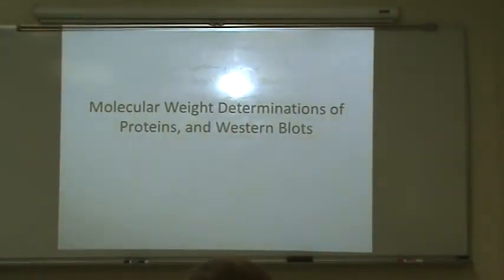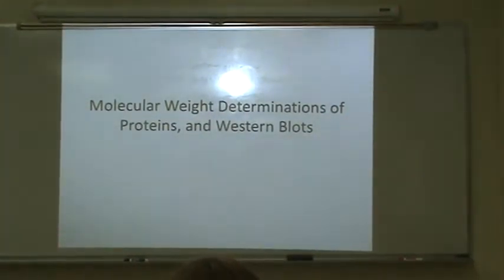Graduate school, or if you are interested in doing summer research, or if you ever want to work in a molecular biology lab, this, out of all the things that I teach you, this is the packet that you don't want to lose. And in fact, I recommend that you take it with you to your research experience, because I'm going to talk about a lot of really useful techniques and how to interpret blots and the rationale behind doing Western blots.